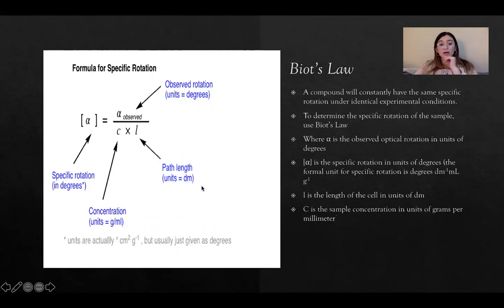In your lab manual, this equation is given a little bit differently, but this is just the manipulated version of that equation. The equation right here, the one that's in the PowerPoint, is the one that's going to help you for your post-lab questions. I feel like this is labeled very accurately, and the labels in the equation are going to help you differentiate between everything.